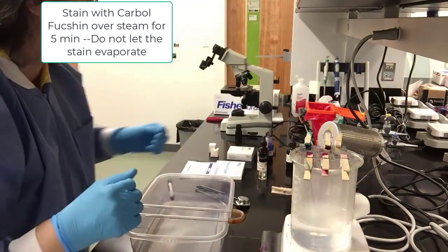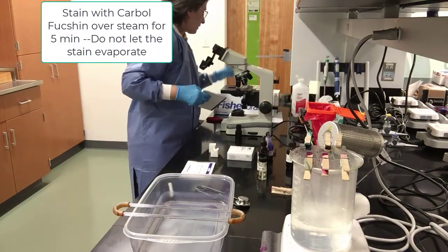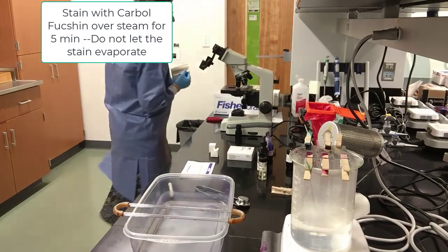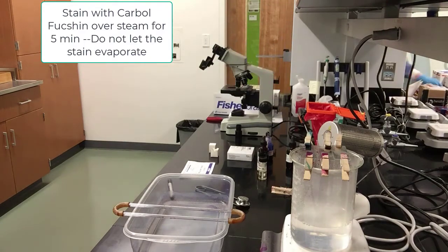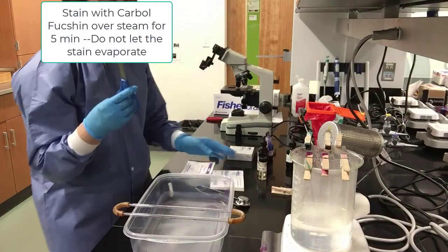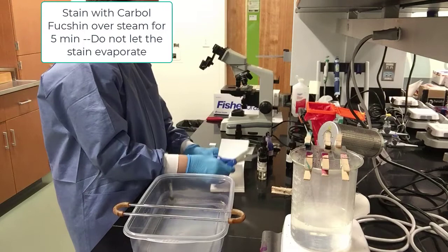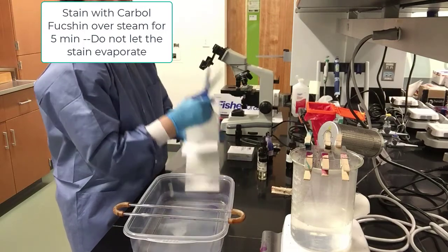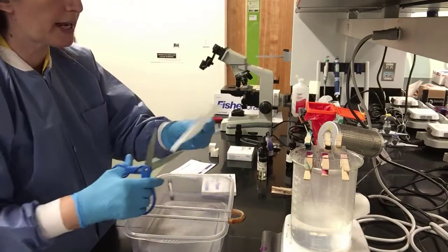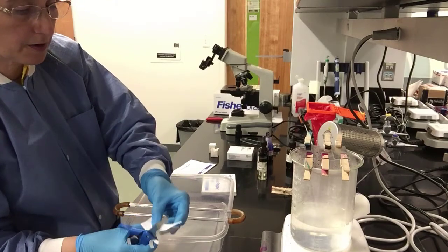So now we will stain with carbolfuchsin over steam for 5 minutes. But we need to put a little piece of paper over the specimens to make sure that they're not evaporated. I'm going to go get my scissors because I forgot my scissors. And I'm going to cut some pieces of bibulous paper, just perfect to fit over the 3 slides that are sitting over the steam. Again, the bibulous paper will help prevent the evaporation and the drying up of the specimen.